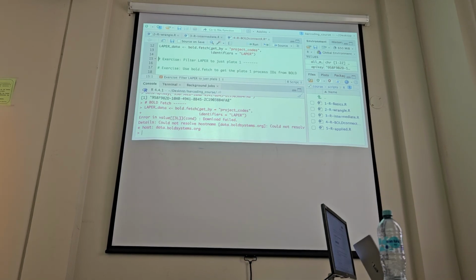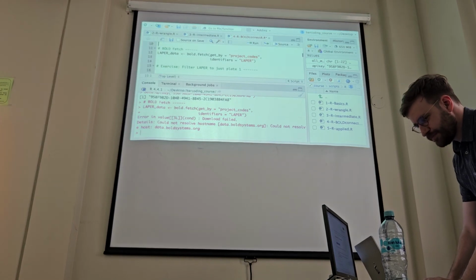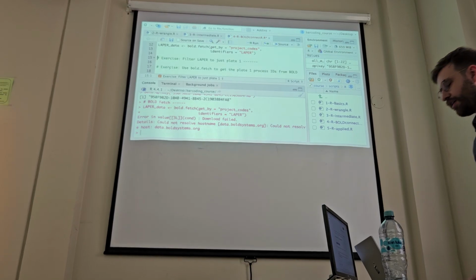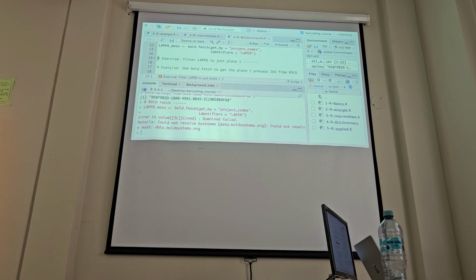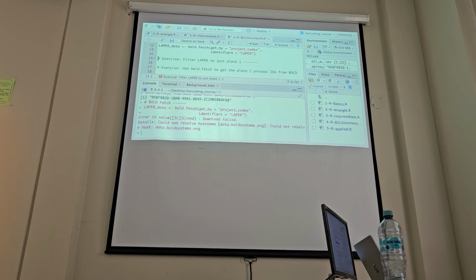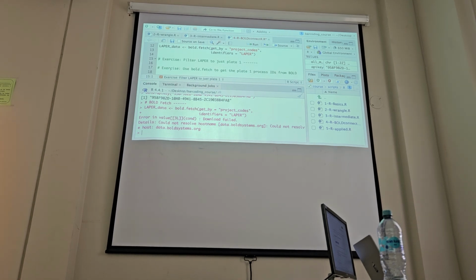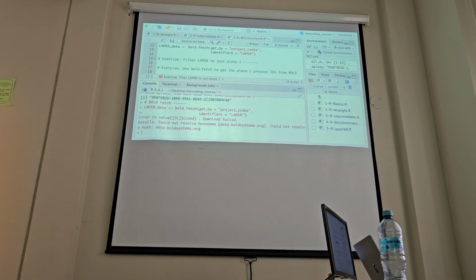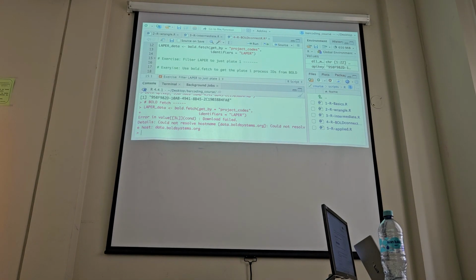Uh-oh. Could not resolve. This has never happened before. Is BOLD down? No, you're on the laptop, aren't you? Oh. I don't have internet. Does this work for you guys though? Yeah, I don't have internet.